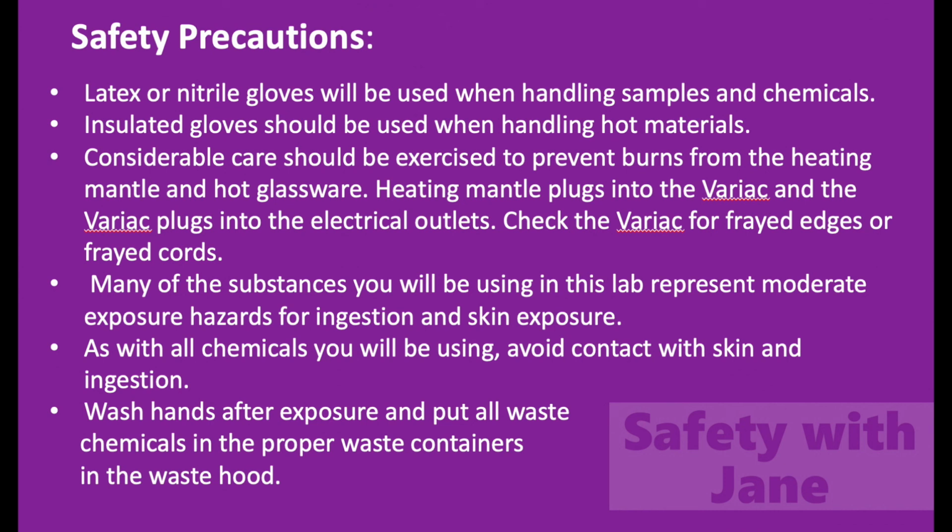Many of the substances you will be using in this lab represent moderate exposure hazards for ingestion and skin exposure. As with all chemicals you will be using, avoid contact with skin and ingestion. Wash hands after exposure and put all waste chemicals in the proper waste containers in the waste hood.